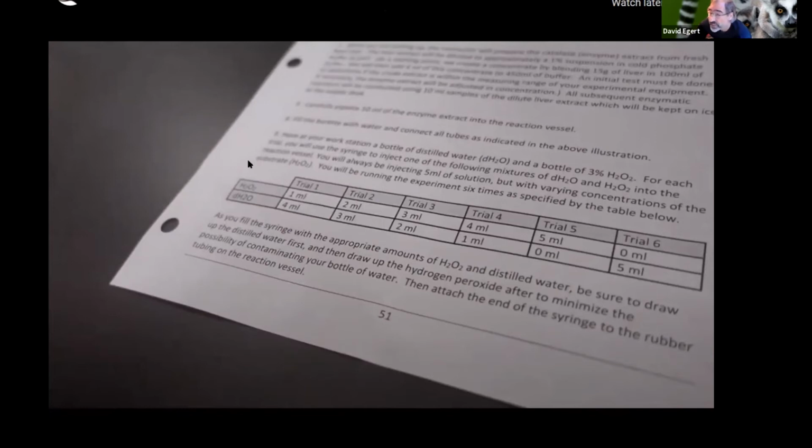Each of these trials is a dilution of hydrogen peroxide, either pure hydrogen peroxide solution, which would be 5 mils H2O2 and no water, or pure water and no hydrogen peroxide, and then we have the whole range in between. So that will be our independent variable.